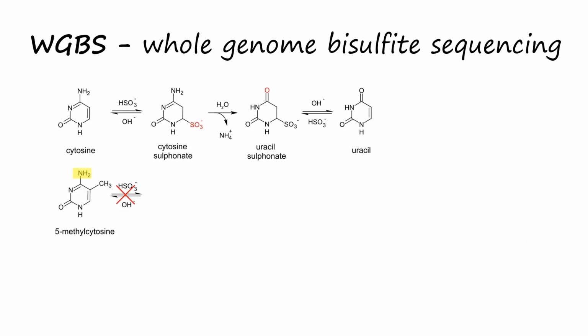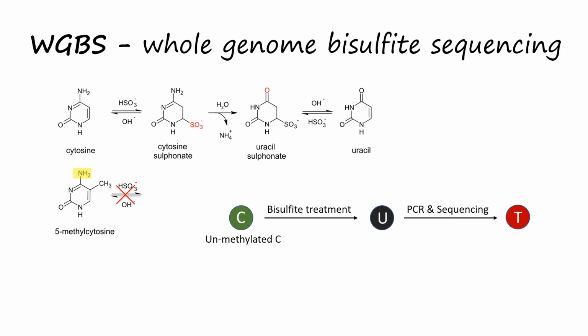To measure the DNA methylation level, bisulfite treatment is used to treat the genomic DNA before routine sequencing, and this treatment will convert cytosine residues to uracils, which leaves 5-methylcytosine residues unaffected. To be more specific, upon bisulfite treatment, unmethylated cytosines are deaminated to uracils, which upon sequencing are converted to thymidine.